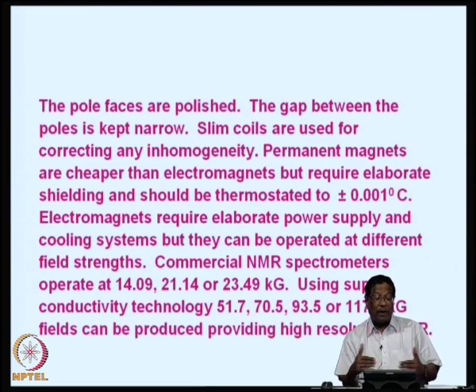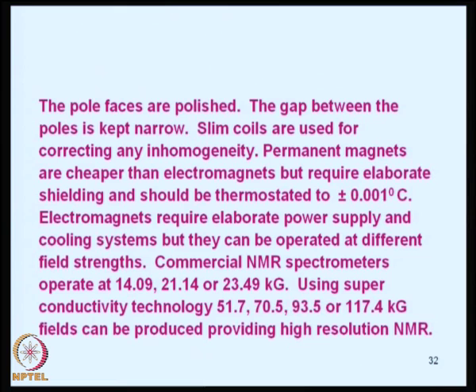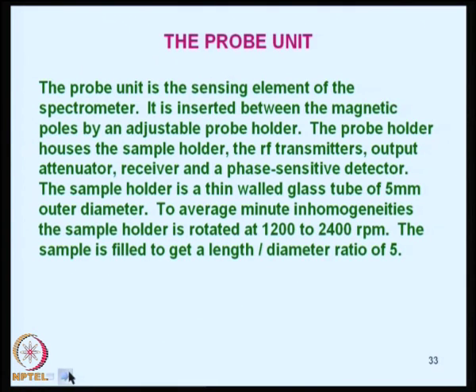Using superconductivity technology, we can even operate them at 51.7, 70.5, 93.5 and even 117.4 kilogauss fields can be produced, which can provide very high resolution NMR.